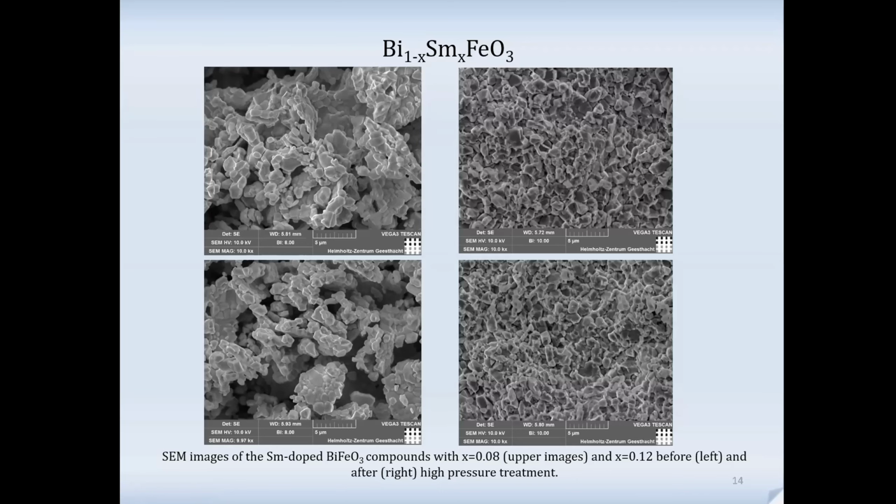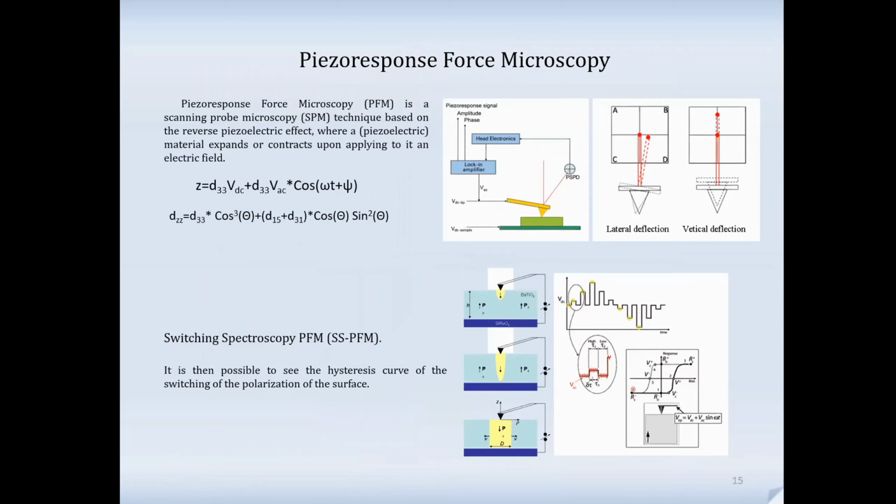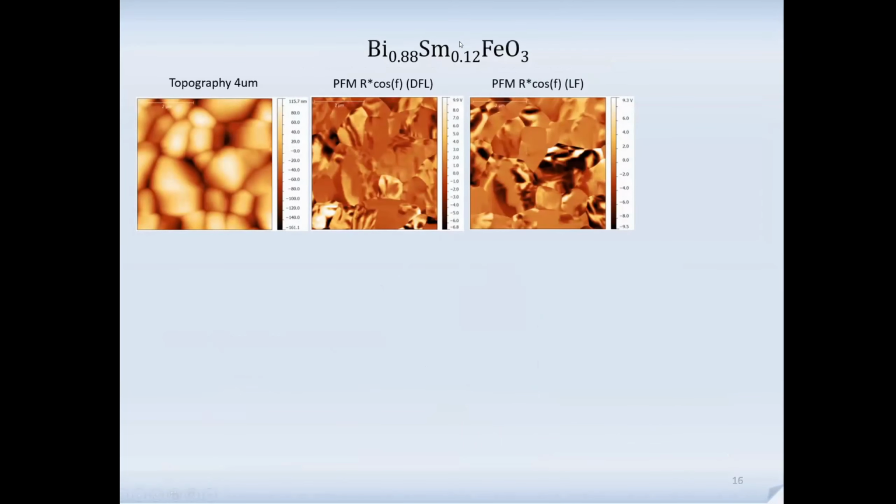So we've made PFM, and I guess in the parallel session yesterday Denis Alikin presented a nice talk about PFM, piezoresponse force microscopy. I will not focus on these slides, just to explain how it works. We made measurements for the compound prepared by solid state reaction, and it was quite easy and fine to resolve the grains. This is 12%, so this is the phase coexisting state.